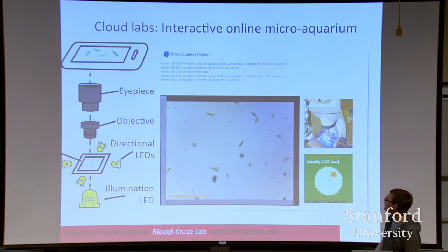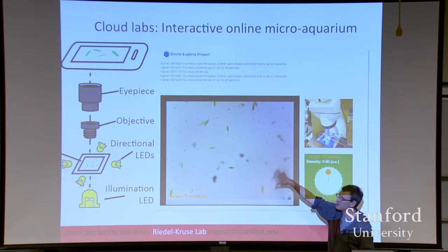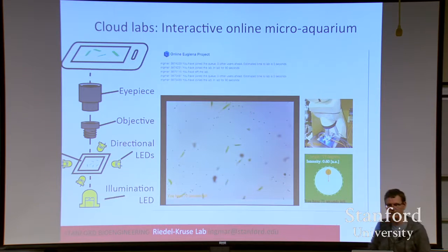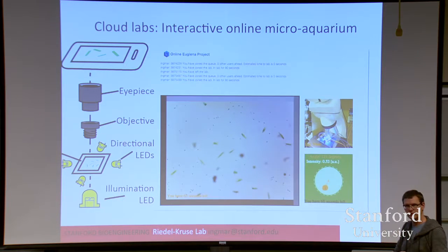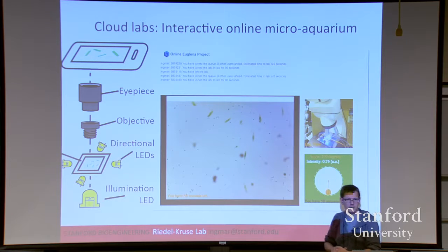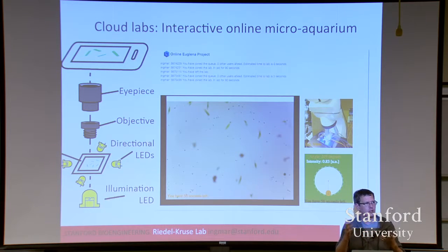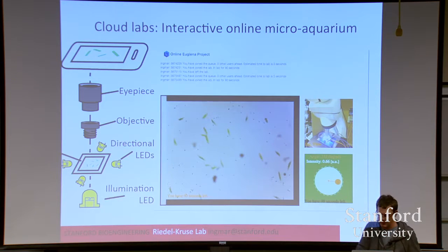And if you follow it for a while, then you see, when the light is coming from here, that after some time, cells start moving up, right? And you can basically playfully explore just by going to a website. And again, appreciate that these cells are not deterministic. There's all sorts of stuff going on. Image data is generally rich, which makes really room for discovery, both for student level, but maybe also in the future for researchers.